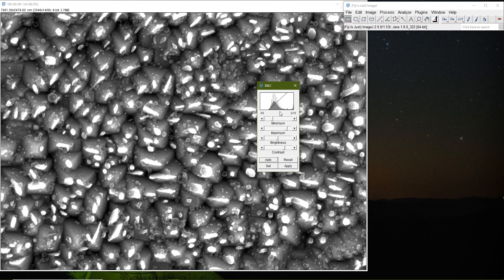We have to look at the image and understand what is happening with the grayscale, and only then can we understand it. I can see the particles, but to tell the computer what is a particle it has to be either very bright or very dark. I have to adjust the brightness and contrast in a way that I can clearly distinguish particles from the matrix.